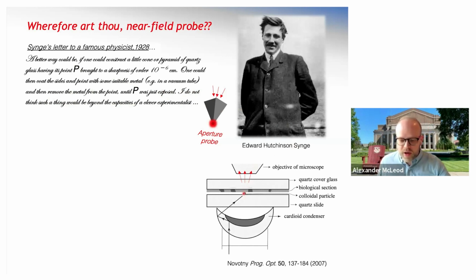What if we take a little nanoparticle instead and illuminate the nanoparticle with light? And what if we bring that little nanoparticle close to some region that we want to image, maybe scan it around? And then if the light waves are only scattering off of this little nanoparticle, which is very small, then we might be able to bypass the diffraction limit in this way as well.